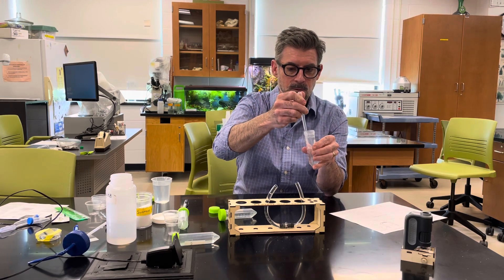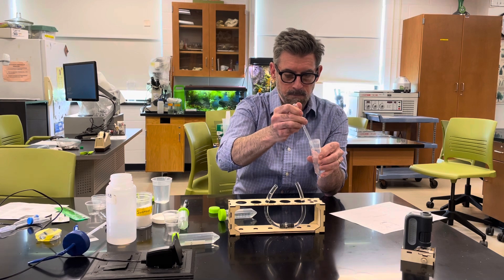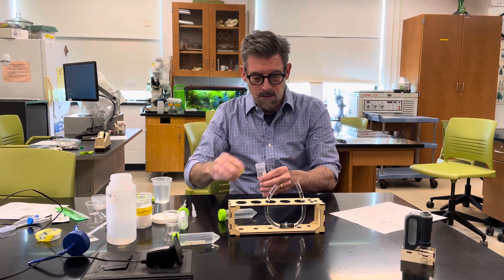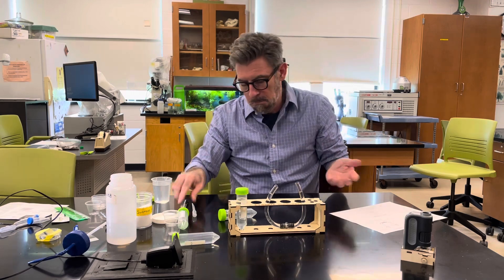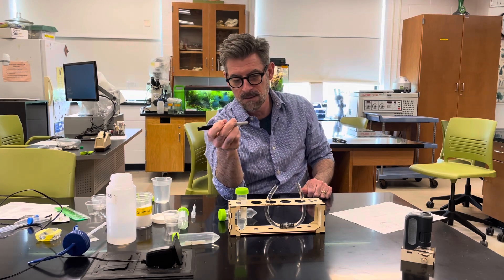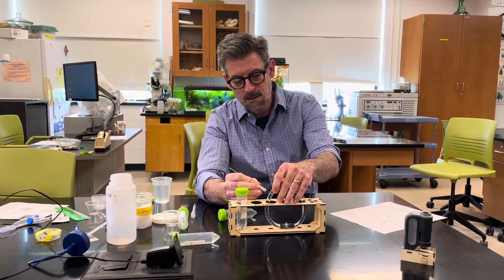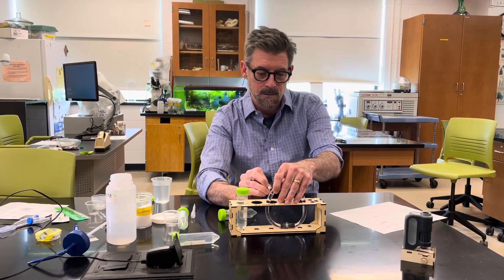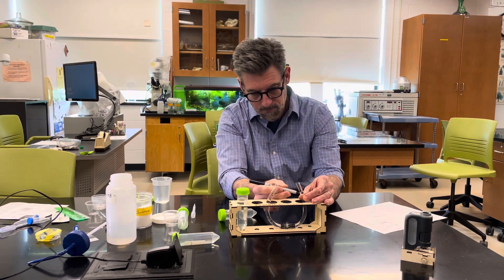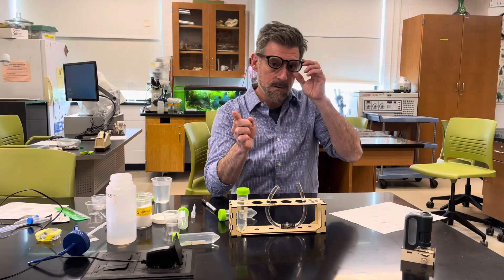Bring the sugar solution up to the exact same height as the water — about an inch from the top. Once both sides are at the same level, you need a sharpie to draw a line around each tube marking the current water level. If you don't have a marker, use a piece of tape or another method to mark the line. Now wait six hours.